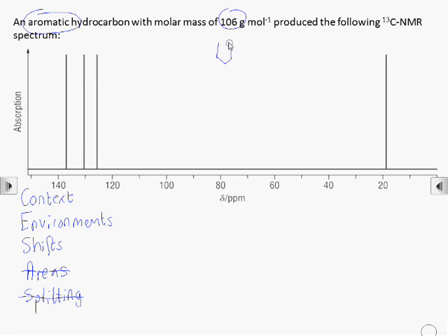So, if we start to interpret, a good starting place would be to break down that molar mass and see what parts of the molecule they're going to be.